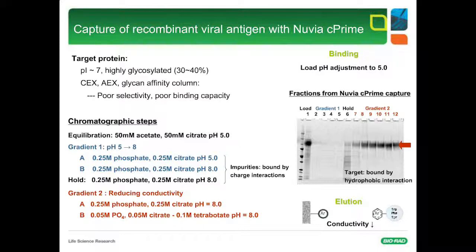And you can also write to me. I can send you a slide to show you the separation of Fc fragment, Fab fragment, and the full-length IgG on a CHT, so you can get an idea about the strength of the interaction and under what condition you will be able to elute the bound fragment from CHT.